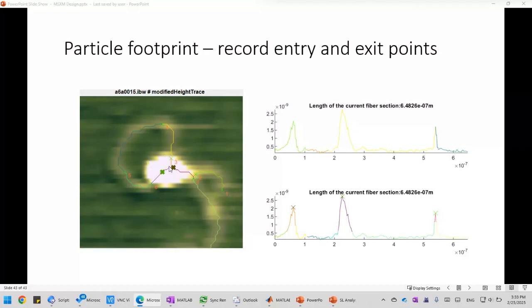If the protein is small, then we do not need to worry that much, right? The location of its peak would represent the location of the protein. But if the protein complex is huge, composed of multiple proteins, such as this one, then the location of the peak only represents a tiny portion of the protein complex.